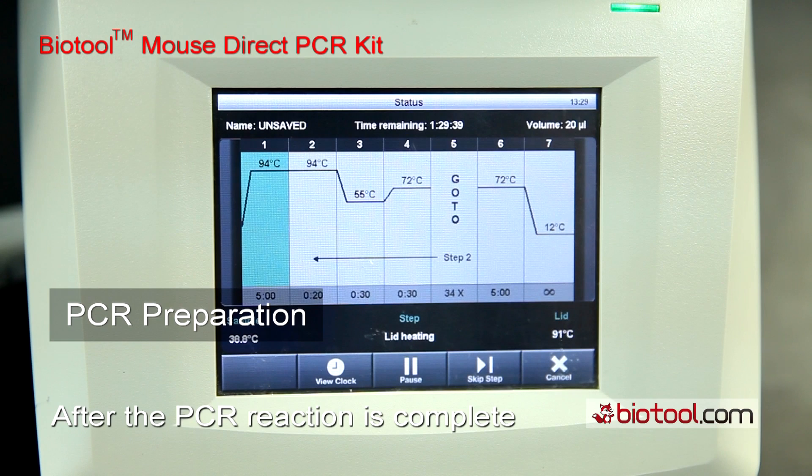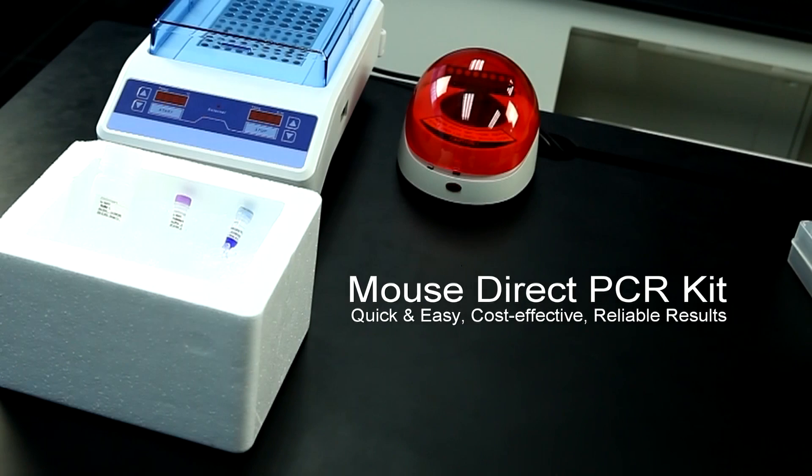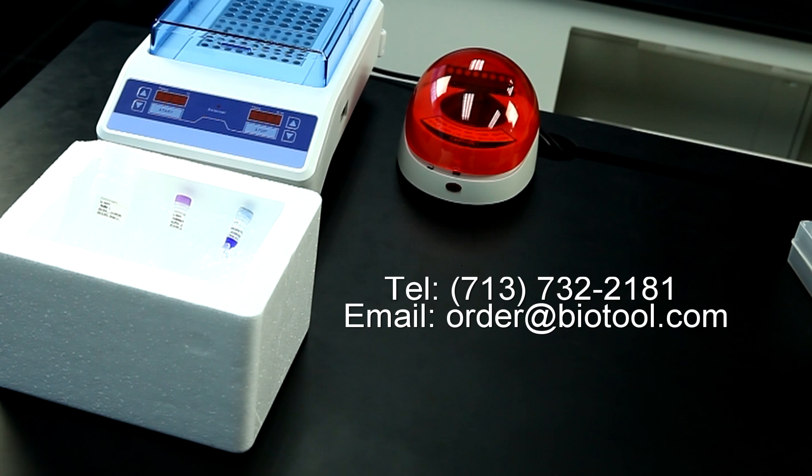After the PCR reaction is complete, directly load samples into the gel and examine the results. Should you encounter technical difficulties, please feel free to contact BioTool directly. Thank you.